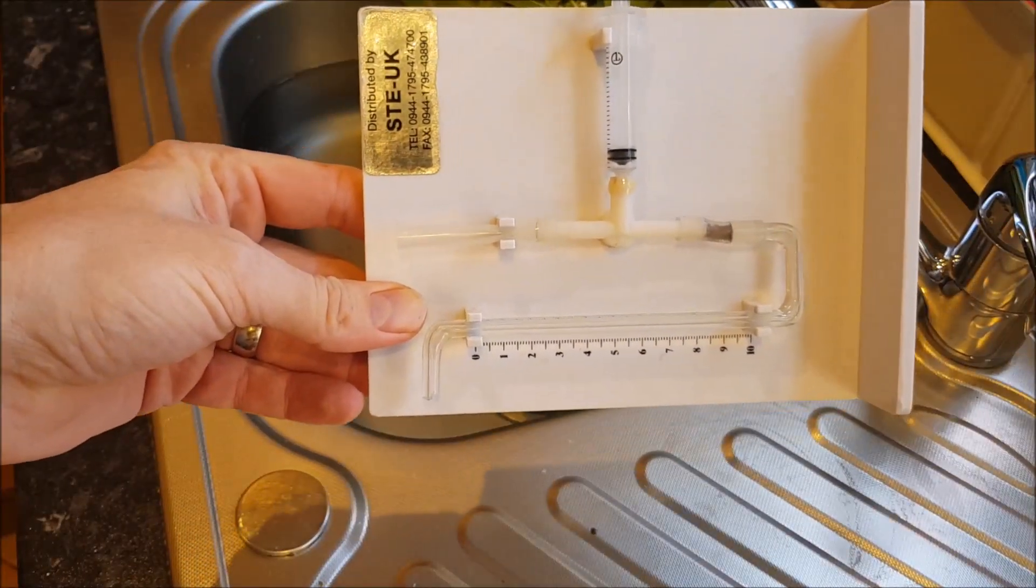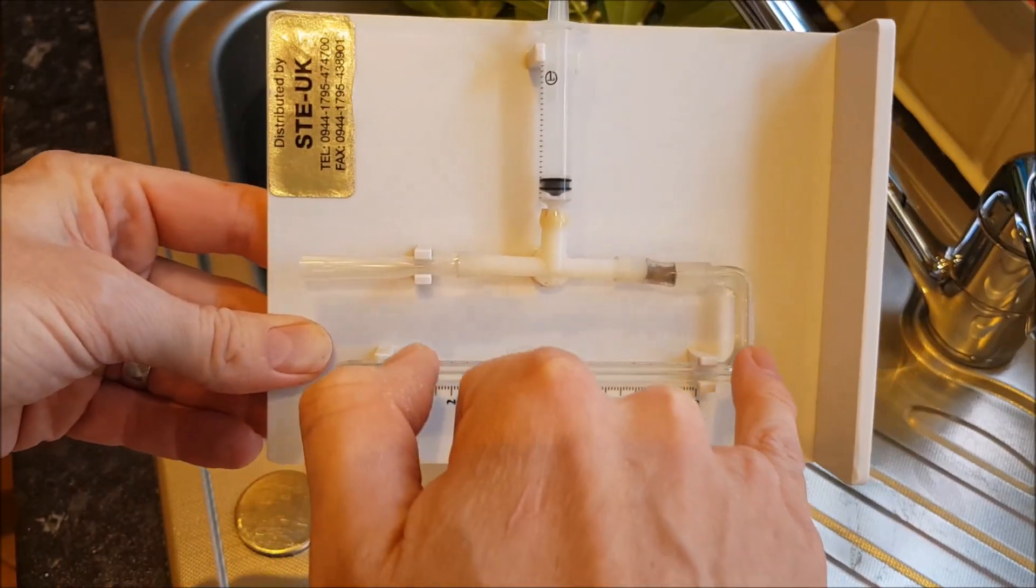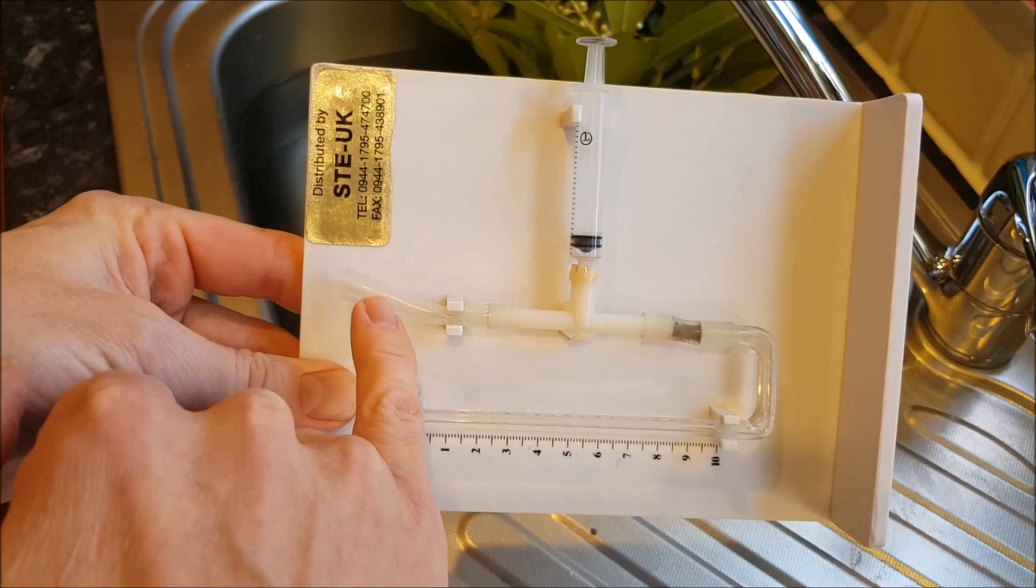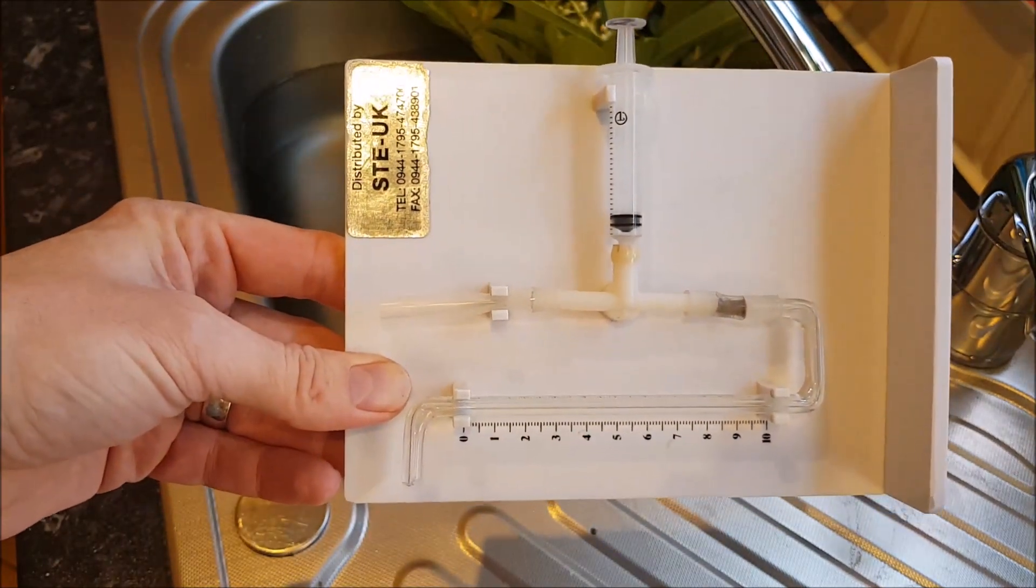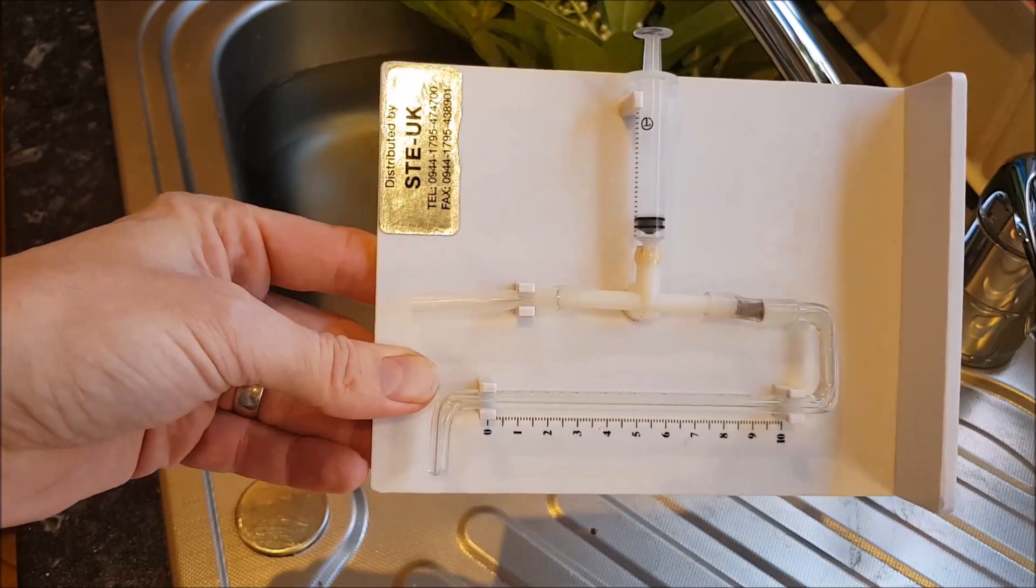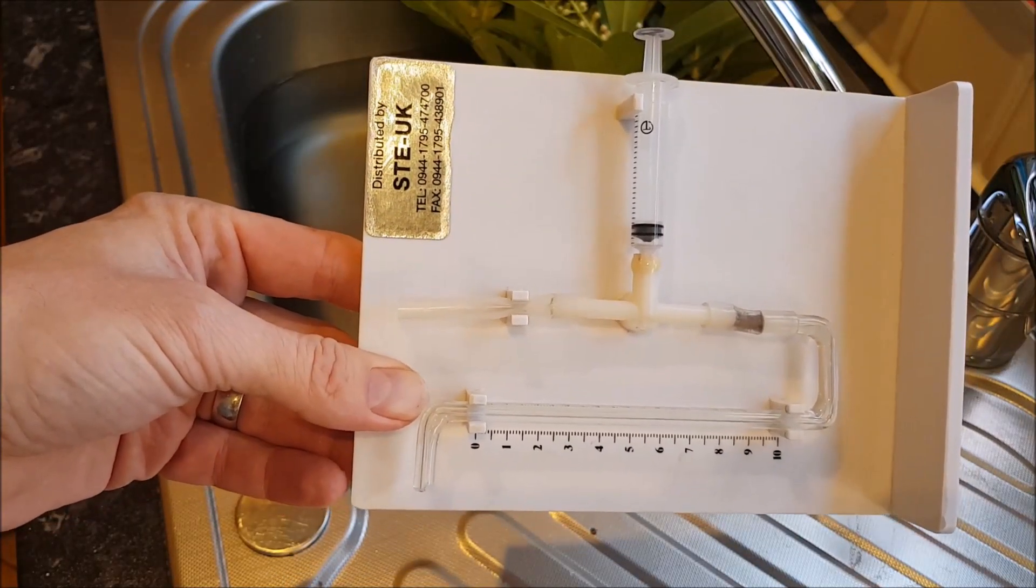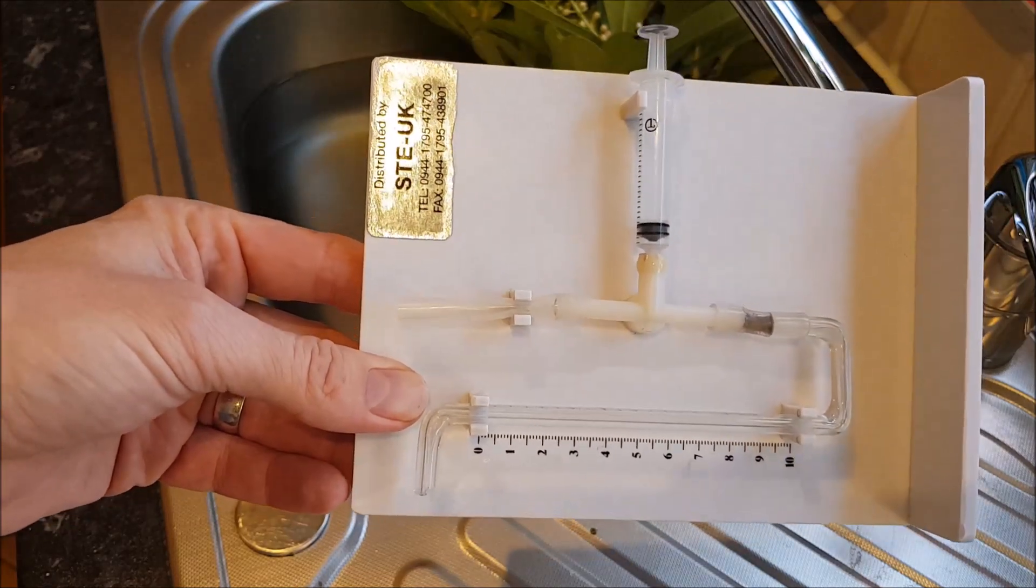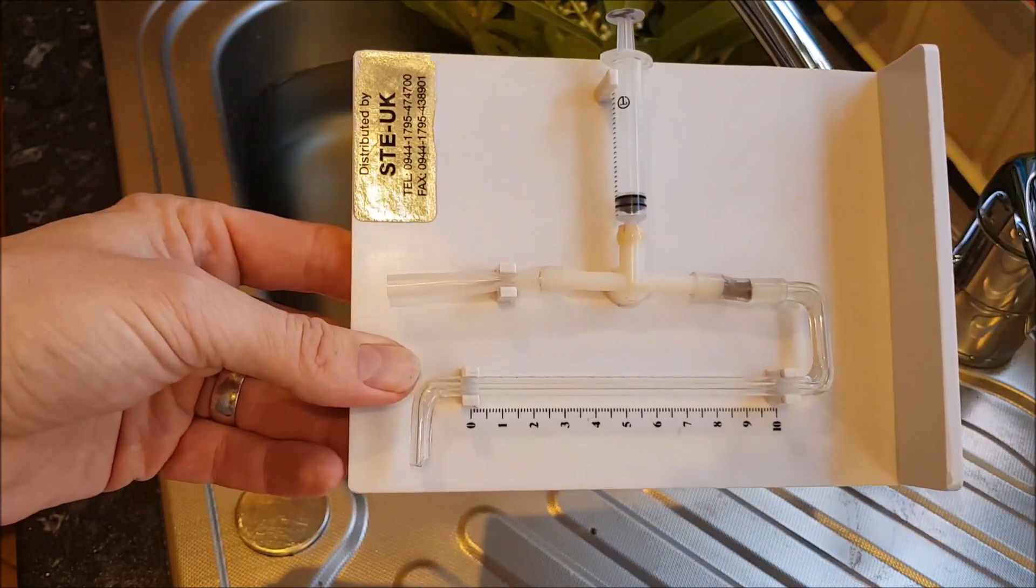This is a potometer. You can see it has a capillary tube and then it connects up to some plastic here, there's a syringe and then there's some rubber tubing. Now a potometer is used for measuring water uptake which is equivalent to transpiration, but because plants use water for photosynthesis and they might be using some of it for turgidity, it's not an exact measurement but we assume that it is. So water uptake equals transpiration.